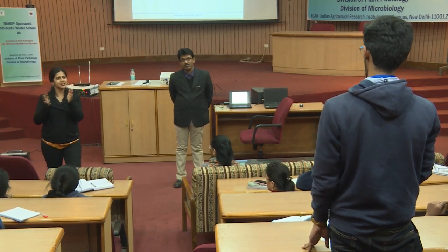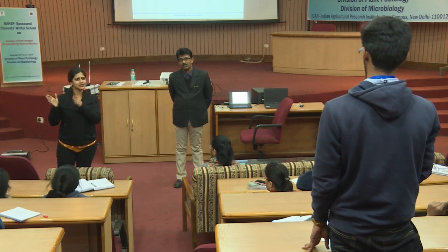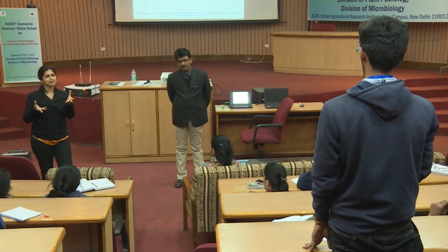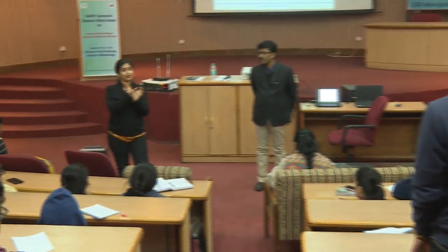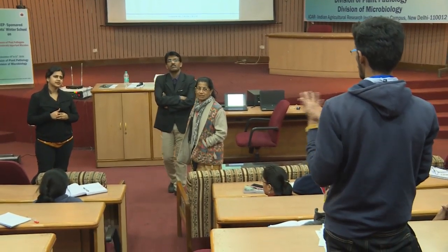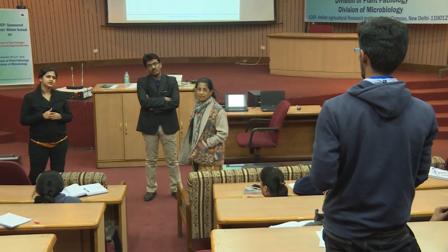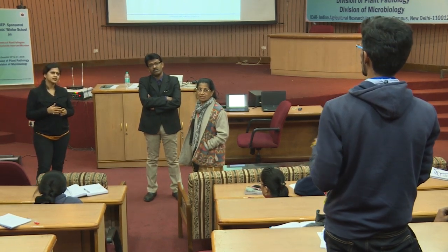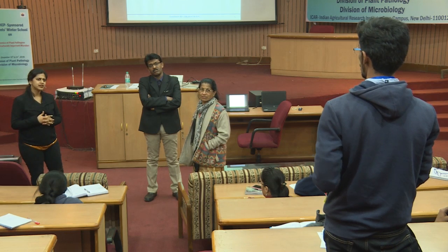Because I am cutting down into shorter sequences, it becomes very short. 21 bases, 15 bases is very short for me to go on overlapping those sequences. Well, when we have long reads, what is the necessity for going for a k-mer-based approach, where we are still increasing the complexity in the case of repetitive regions? Why doesn't the OLC approach hold?